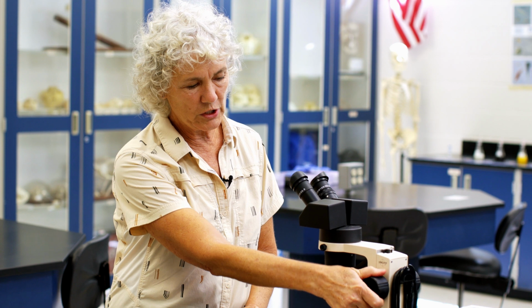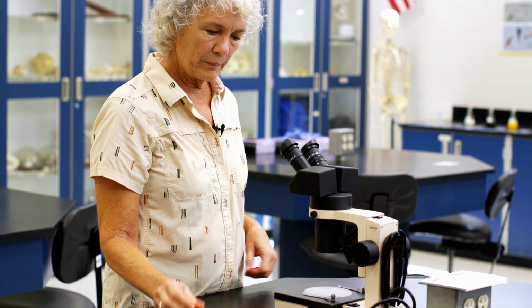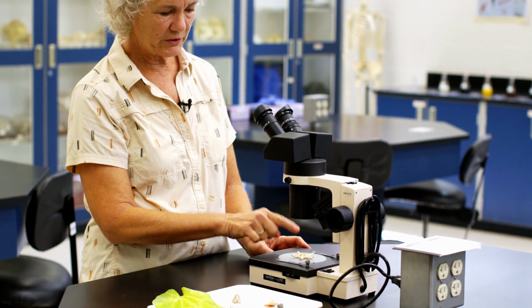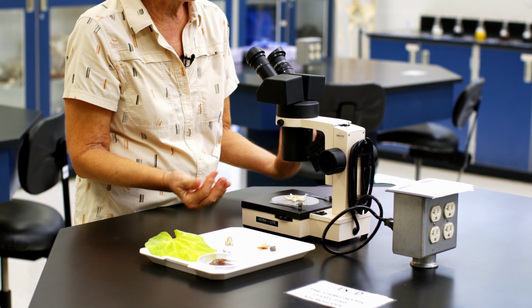All right, so if you're looking through here, it's the same thing though. You're going to use a knob over here. We don't have a fine adjustment knob, just one knob to get it in focus. And you're going to put whatever item that you would like on the scope down here. Now this is nice because you could look at something that's alive. So let's say you had a worm or something, you could actually look at it underneath the microscope, or you can look at things that are dead or parts of organisms, like bones and things like that.